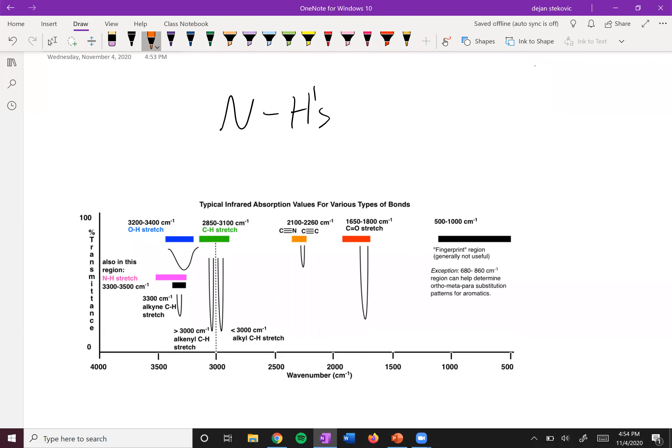All right, next up, we'll move on to NH bonds. These occur over here in this 3,300 to 3,500 region.